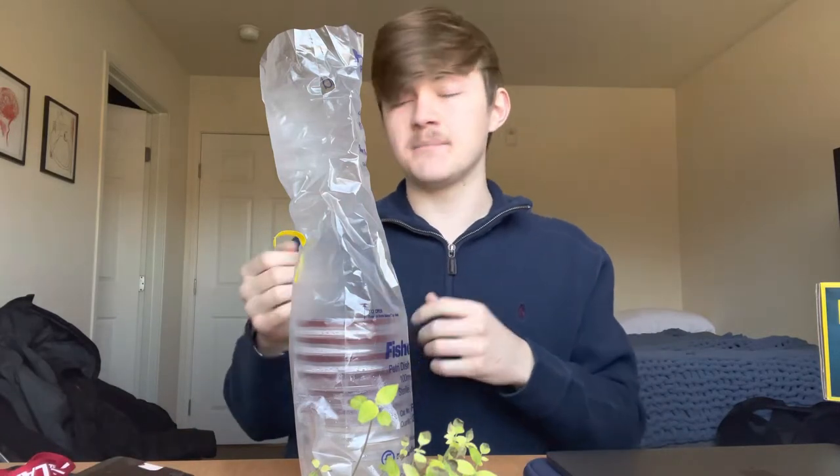We have 15 swabs and 11 petri dishes, so I have more than enough swabs. Even if I mess up or want to do a control, I'd be perfectly fine and not have to worry about running out. So let's get to swabbing.